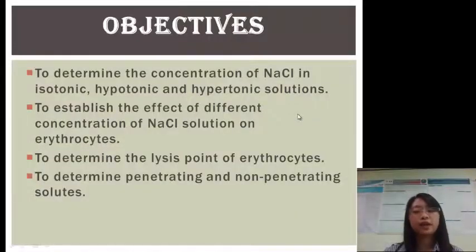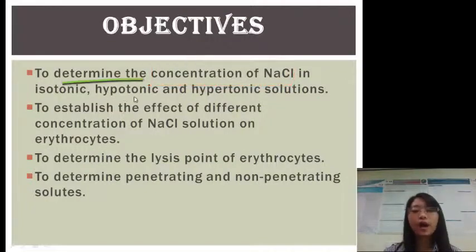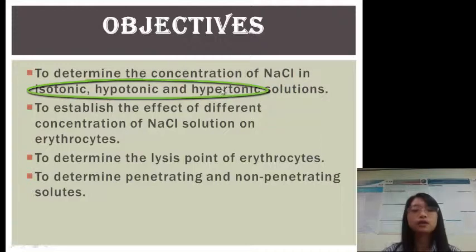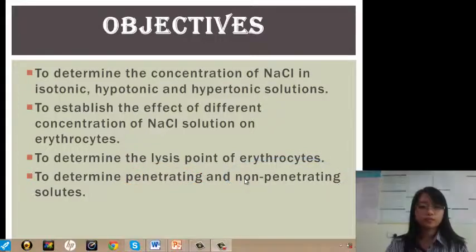Okay, we have done an experiment to determine the concentration of NaCl in isotonic, hypotonic, and hypertonic solutions, and also establish the effect of different concentrations of NaCl solution on the erythrocyte, determine the lysis point of the erythrocyte, and also determine penetrating and non-penetrating solutes.